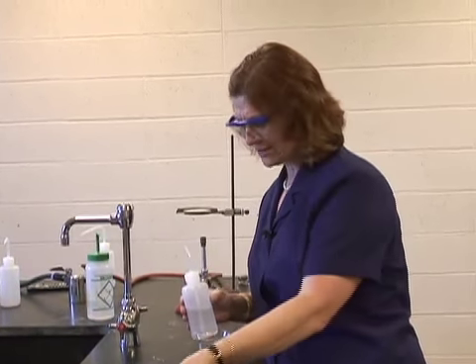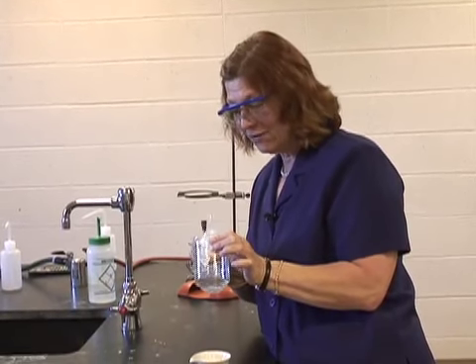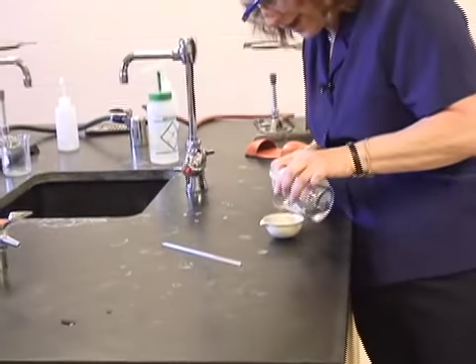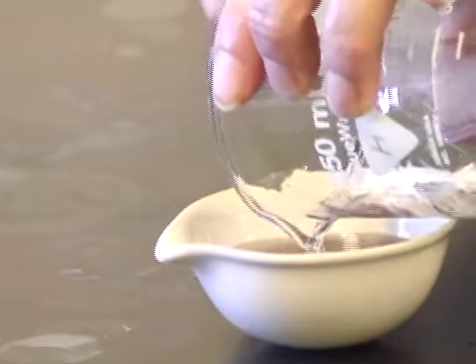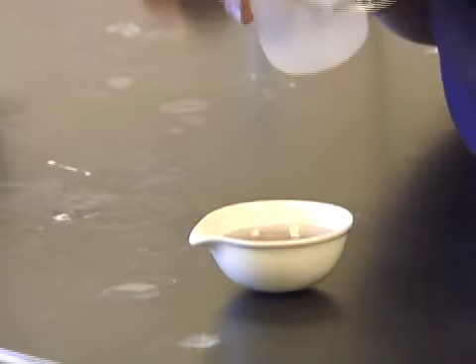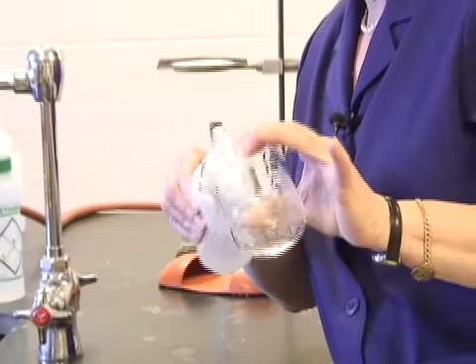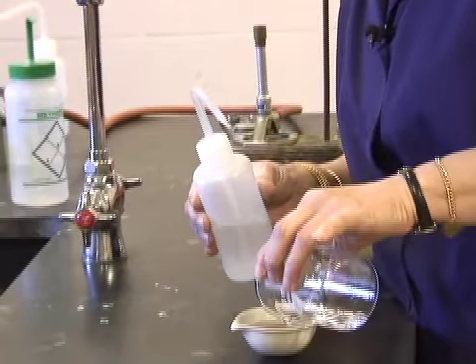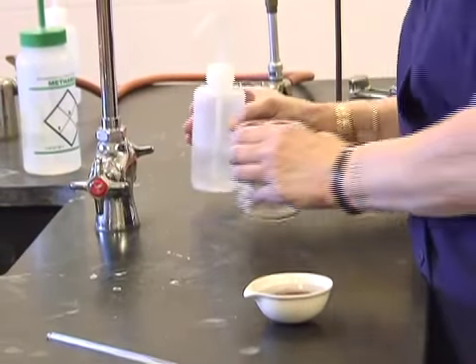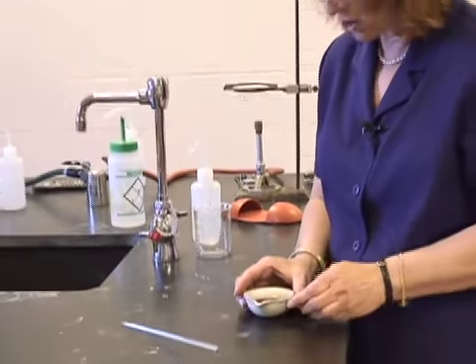Inspecting that stirring rod. Now, I need to get all of the copper out of the beaker and into my evaporating dish. And I'm not too concerned about the amount of water because I'm just going to decant it anyway. I want to make sure I got all of my solid copper off of my beaker. Then I will allow it to settle, and I will decant off this water.